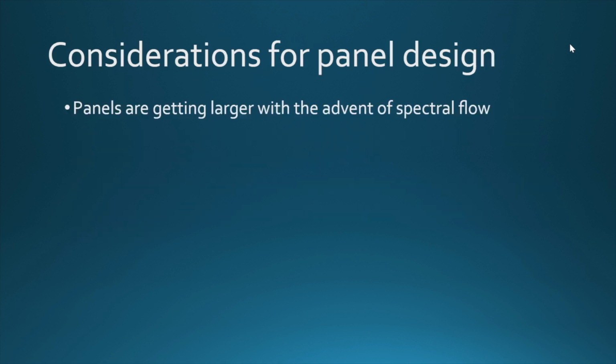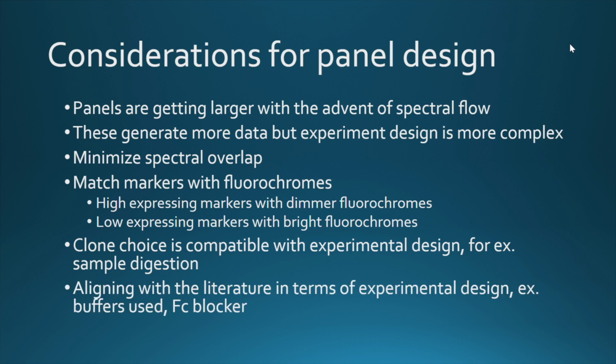So there are quite a few different considerations when you design a panel, right? I think you generally first start by asking a question related to cells or tissues. So you ask a biological question or you formulate a hypothesis that you try to address using this cell biology research technique called flow cytometry. And for that purpose, you need to design a panel, which is where EasyPanel intervenes. That process is generally a bottleneck. The panel design can be quite difficult, especially for larger panels.